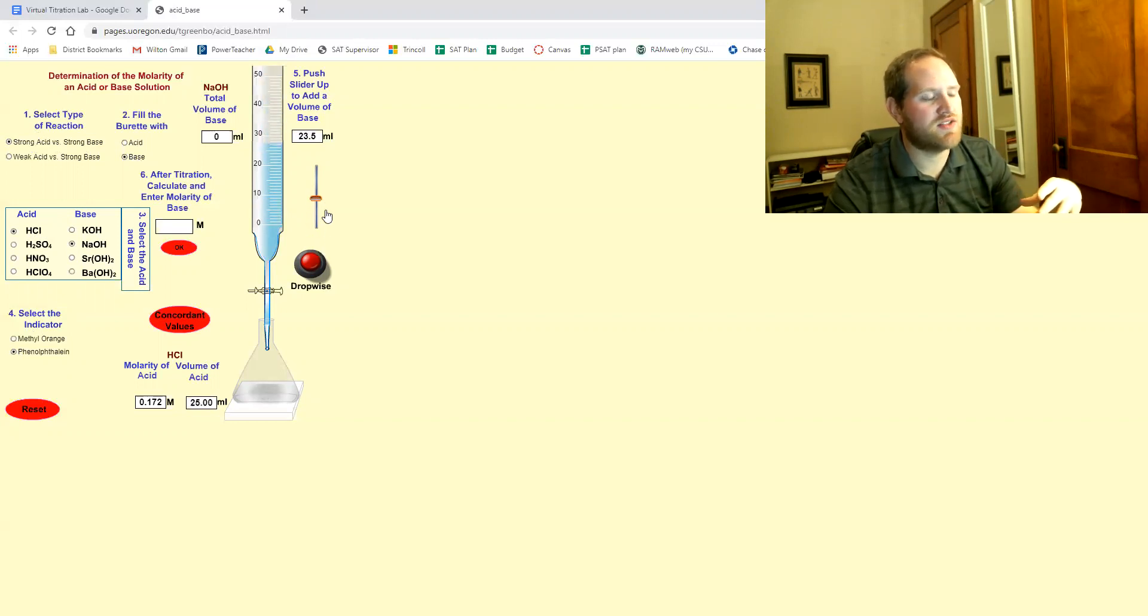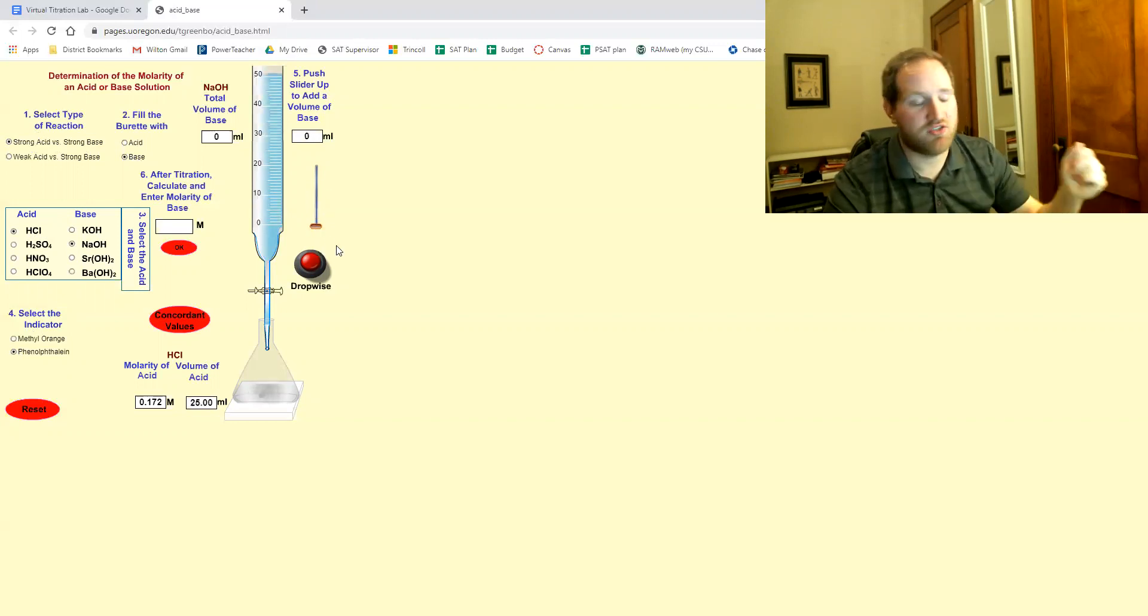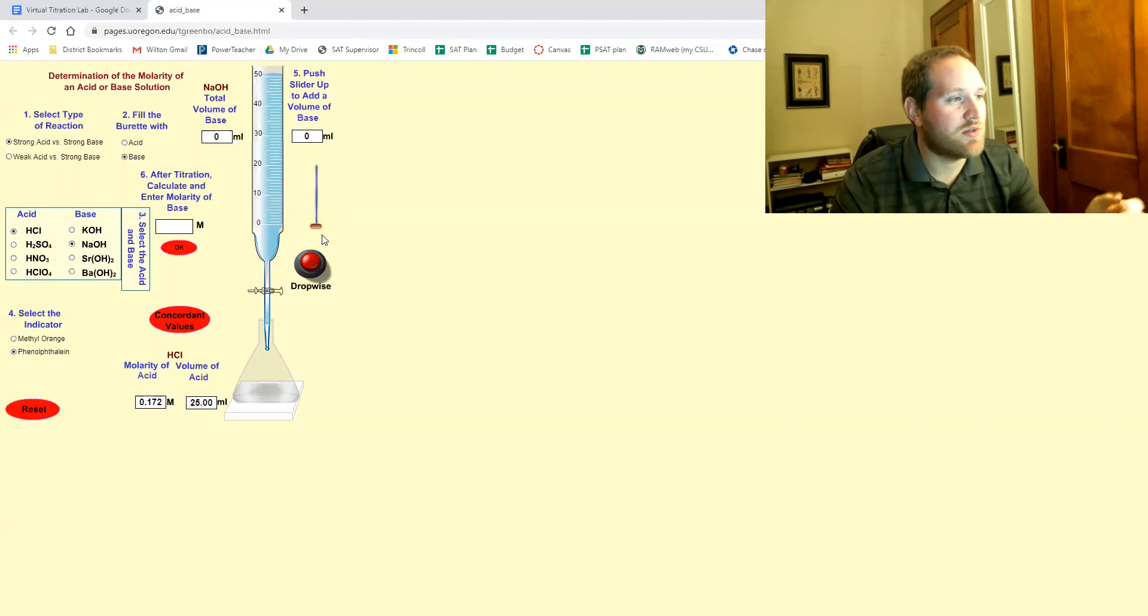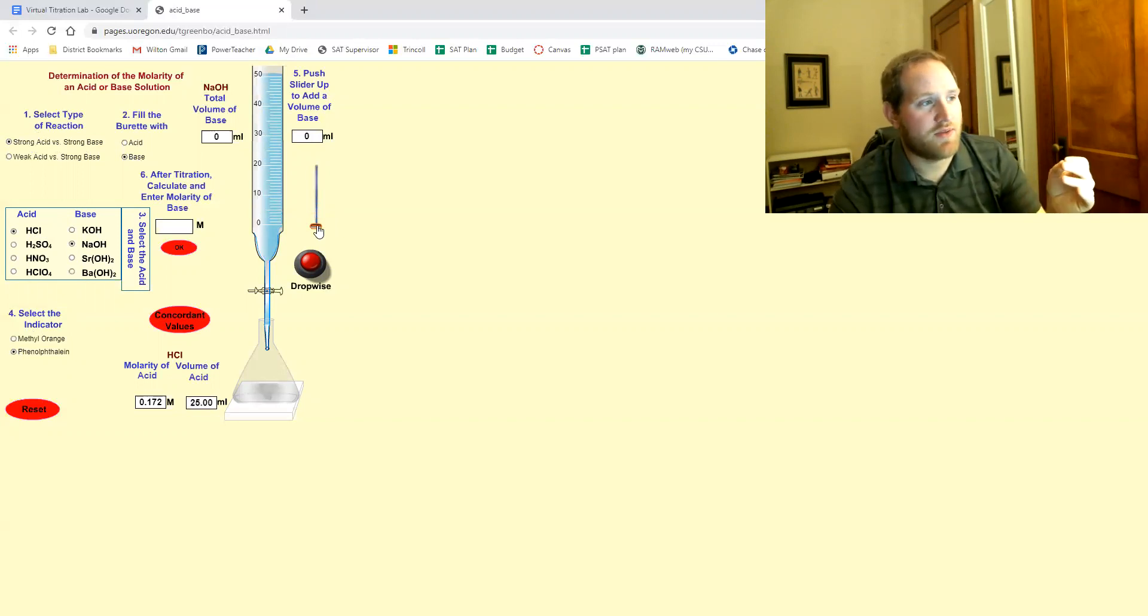But if it doesn't allow you to move this, if it kind of bugs out, just refresh it.